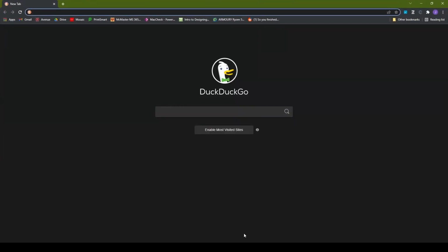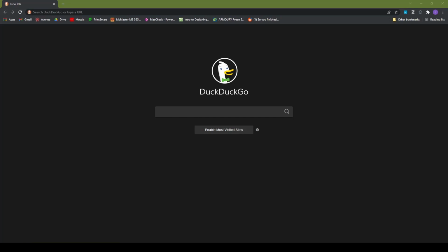And what I will do is type in the link that we're going to use. Okay, so type in the following link above. We'll have it attached in the video description for you to be able to copy and paste as well. So just type it in here and press enter.